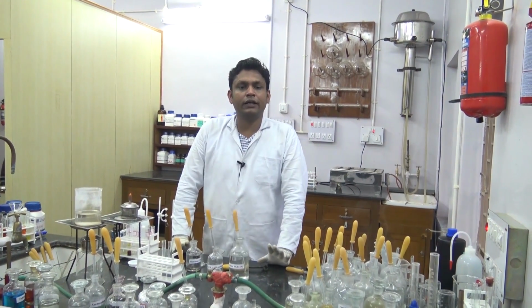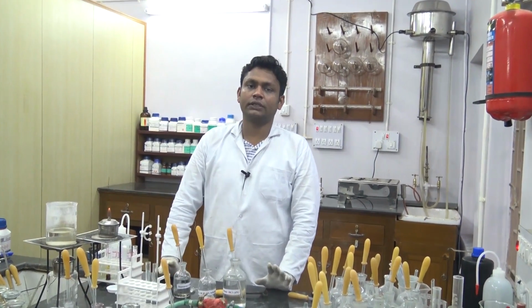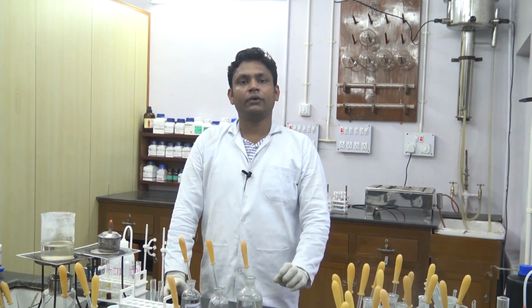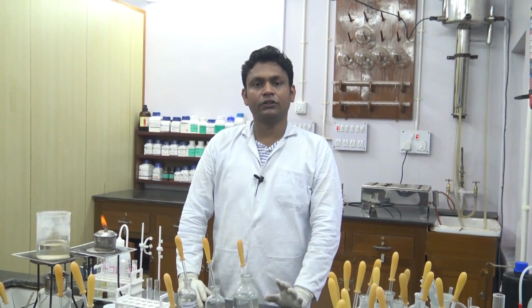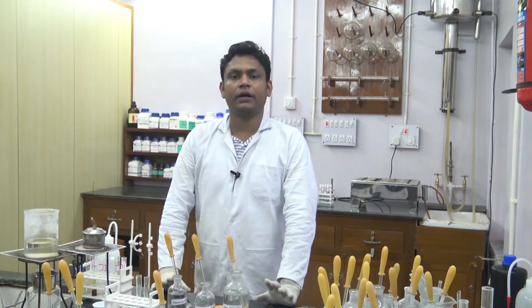So dear students, here we have seen how the basic as well as acidic components of the salt can be determined stepwise using chemical procedure. Hence, by this above procedure, we can distinguish a given unknown salt by their cationic and anionic part.